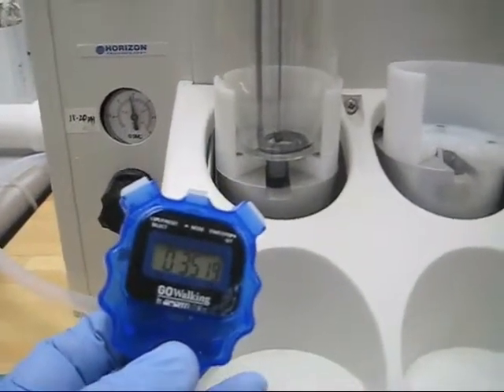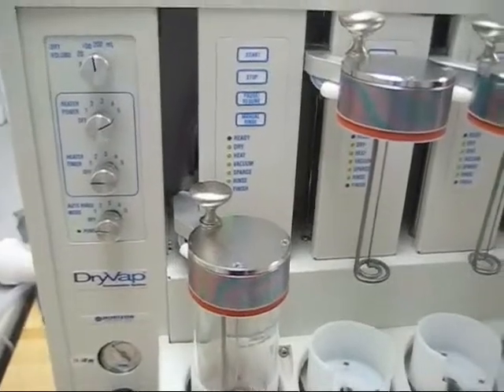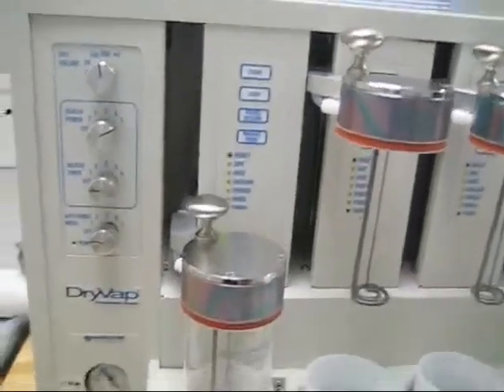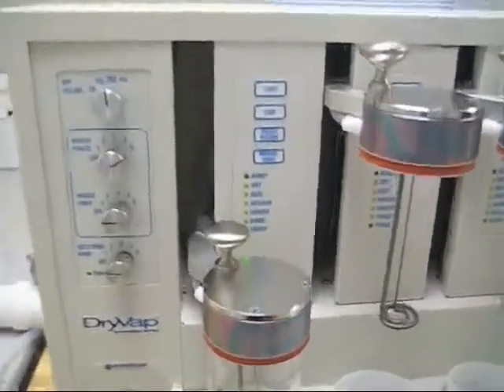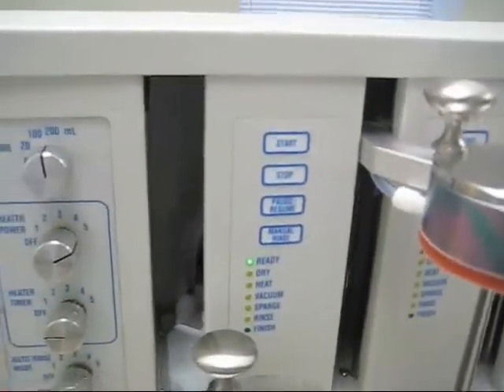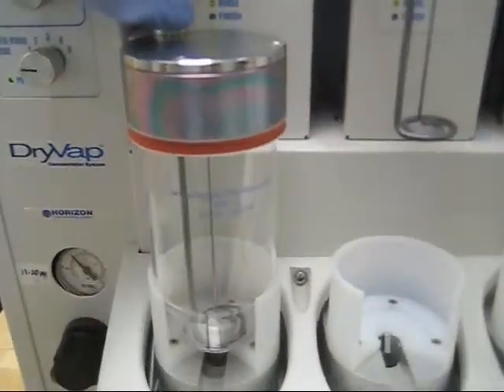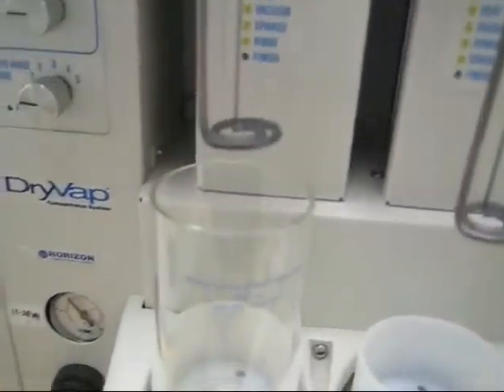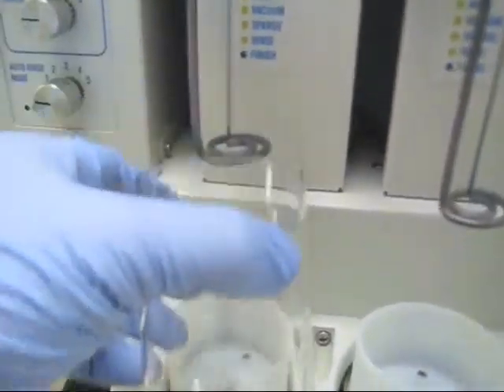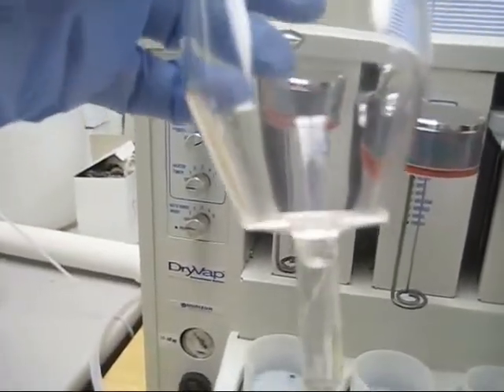That beeping sound you hear — you can turn that up, down, or off depending on your preferences. If you go ahead and stop that, I'll just go up here and hit the stop button, and the beeping will stop. Now you'll notice you're in the ready state. Here the sample is ready to go. I'll go ahead and lift the head and pull out the glass.